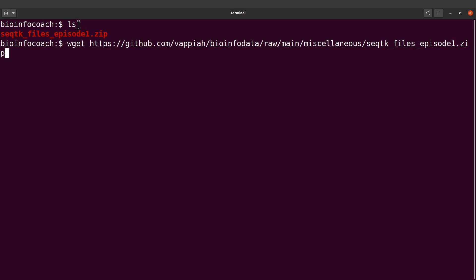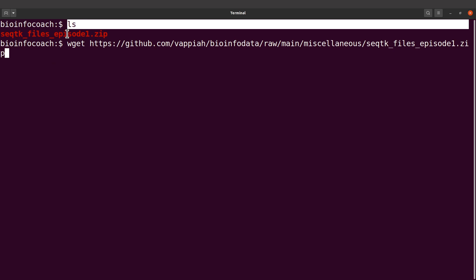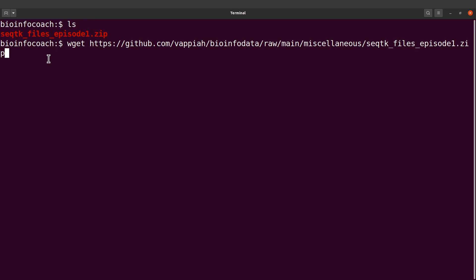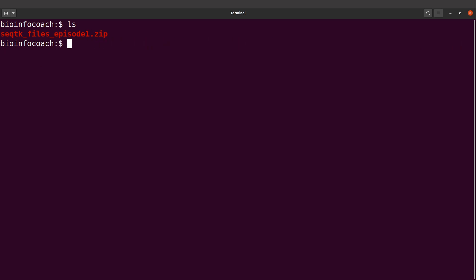I already have mine downloaded, but use this command to get it. Then you can use the ls command to display it.